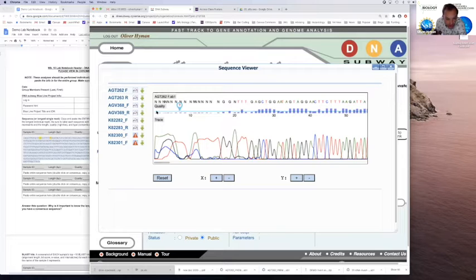Basically, this blue line here represents what's called a PHRED score of 20. That's P-H-R-E-D, PHRED score of 20. All the PHRED score is, without getting into the gory details, is an indication of how high quality each individual base call is. When I say a base call, I mean this letter that you have in your sequence. The machine called this a T at that position. This PHRED score tells you how confident we can be that this A right here is correct, that this G right here is correct, that this C right here is correct. And that purple bar right there indicates the individual PHRED score for that individual base pair.